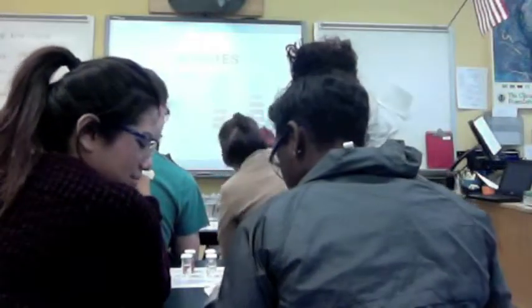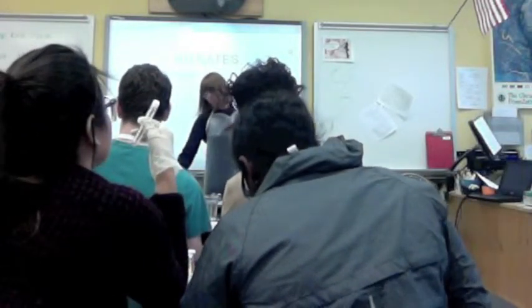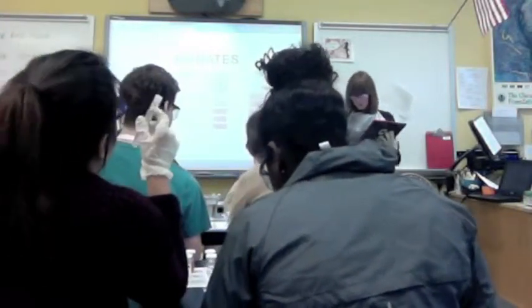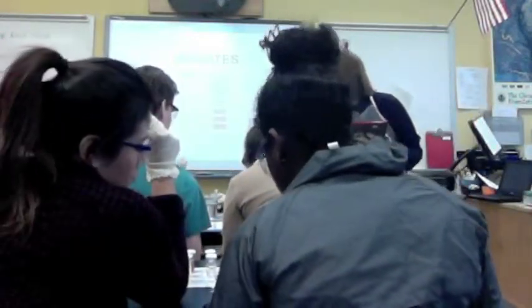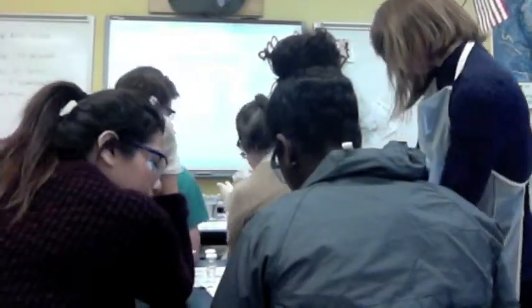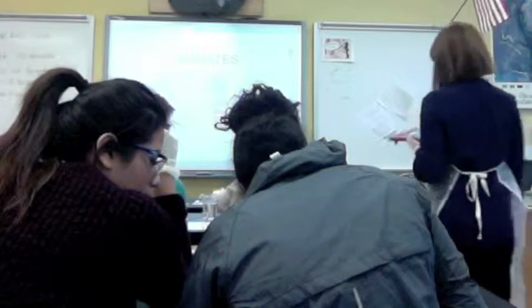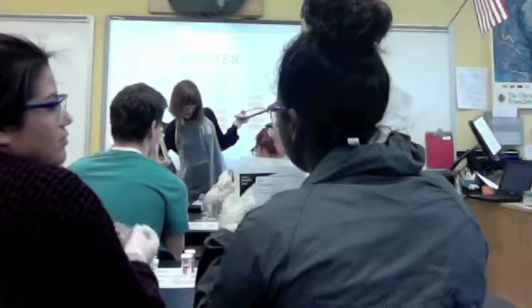Those of you shaking, right here, you guys are number 1, you guys are number 2, and you guys are number 3. And if it changes from blue to orange, that's okay. That's fine. So what color? You're going to be collecting a water sample. You're number 3. Did you write the color? Yes, please write the color. Thank you. It is now orange.